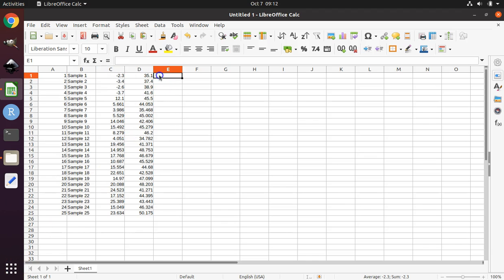Finally, we need to have a column at the end of just the number 1. Why the computer software needs that, I don't really know, but it's what we have to do as part of the file format. So what we can do is enter the number 1 3 times so that it's enough for LibreOffice to recognize a pattern. You can come down here into the corner till you get this crosshairs, and then you can drag that down all the way to the bottom and it will fill it in with the number 1.